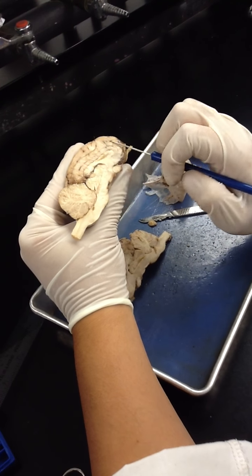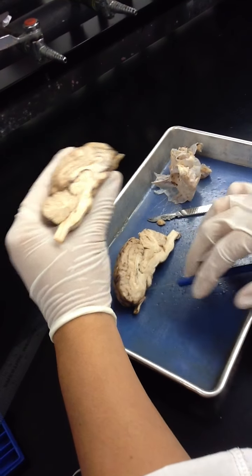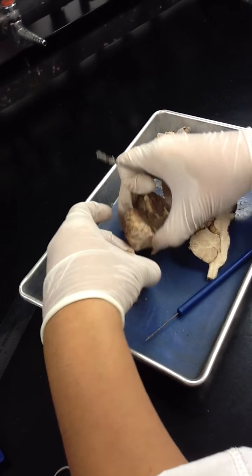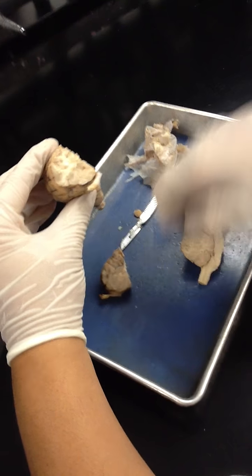And so here's kind of the same thing. So we're going to cut this in half so we can see some of the gray matter. I'm going to do that really quick. Okay, so do you see the white matter in the middle?